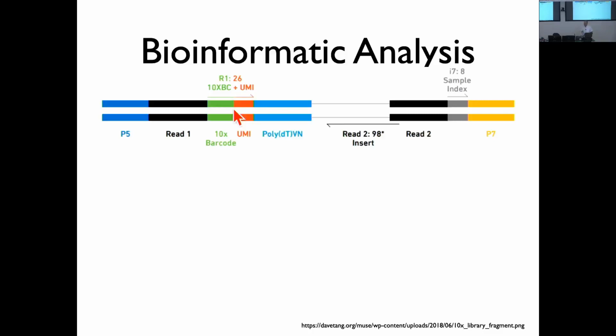But there's no reason why. When I say you can ask for 26 base pair reads, the sequencers are programmable to that extent. The default is that if you do paired end reads, you do equal numbers. If you do 50 base pair paired end reads, it's 50 base pairs from read one, from this priming site, and 50 base pairs from this priming site. But they actually have the flexibility that you can change that. Does that clarify?